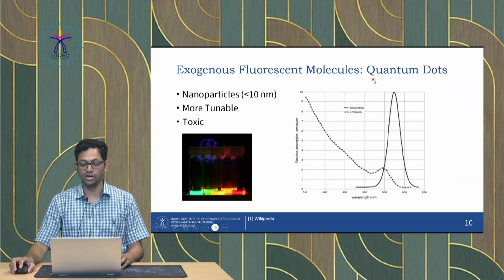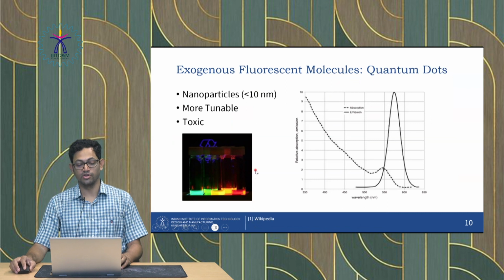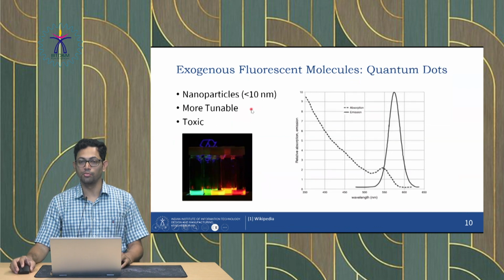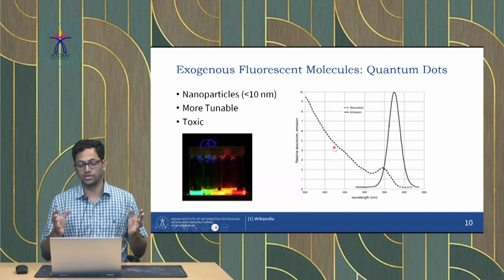Okay, so something kind of new is the quantum dots, which have been specifically used. They have dimensions of less than 10 nanometers. They are more tunable. What we mean by tunable is that we can tune the excitation and emission wavelengths.